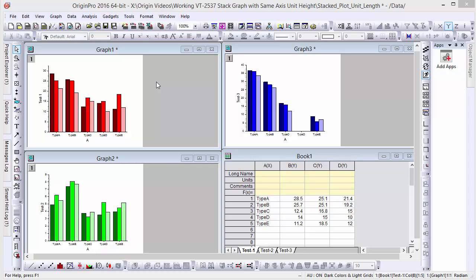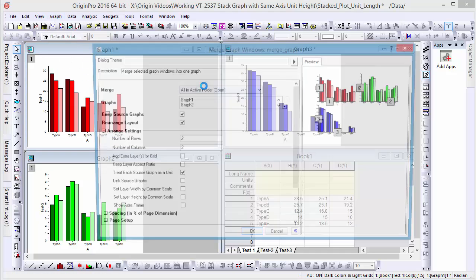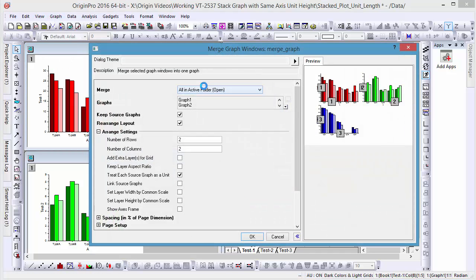Here we have three graphs of test data that we'd like to combine. Let's begin by going to the Graph menu and selecting the Merge Graph Windows dialog box. Here we see a preview of our merged graph.